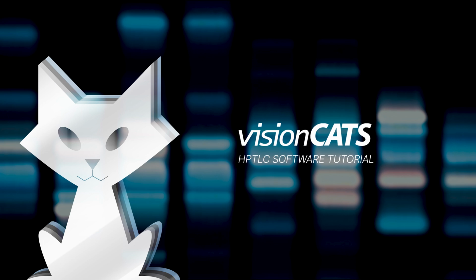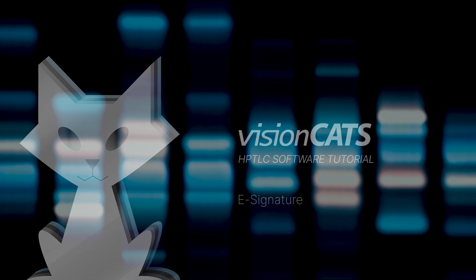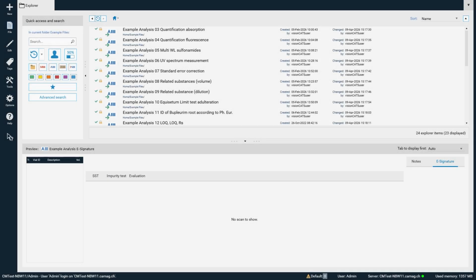Welcome! In this tutorial, we'll explain the e-signature feature in visionCATS, designed to ensure secure, compliant electronic signing of files under 21 CFR Part 11. The e-signature feature is available exclusively in installations that include the 21 CFR Part 11 compliance option.